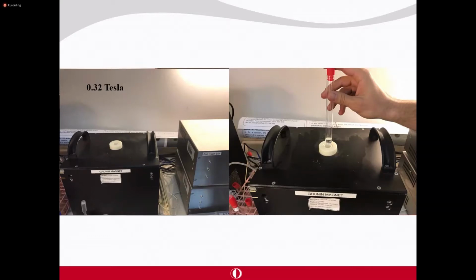For instance, how the status of water is in your sample, or you can quantify oil content in your sample, maybe water content in your sample, how water status is changed, like free water versus bound water, water polymer interaction. So different applications are possible. In terms of a candy, we can also measure moisture content.